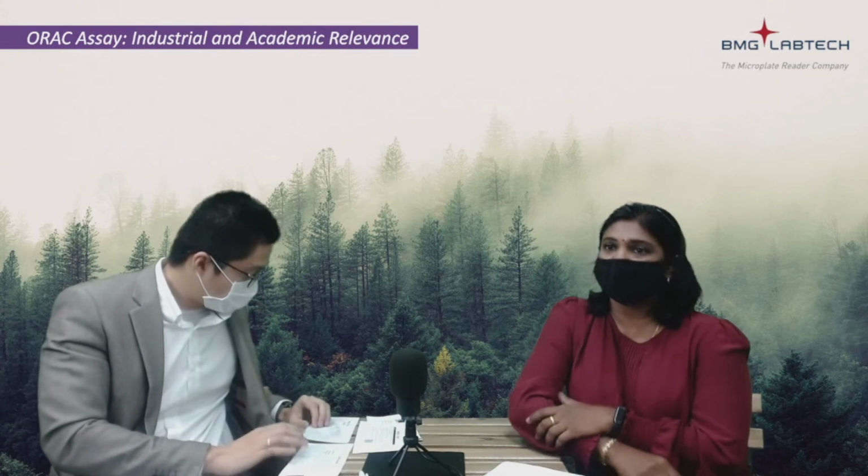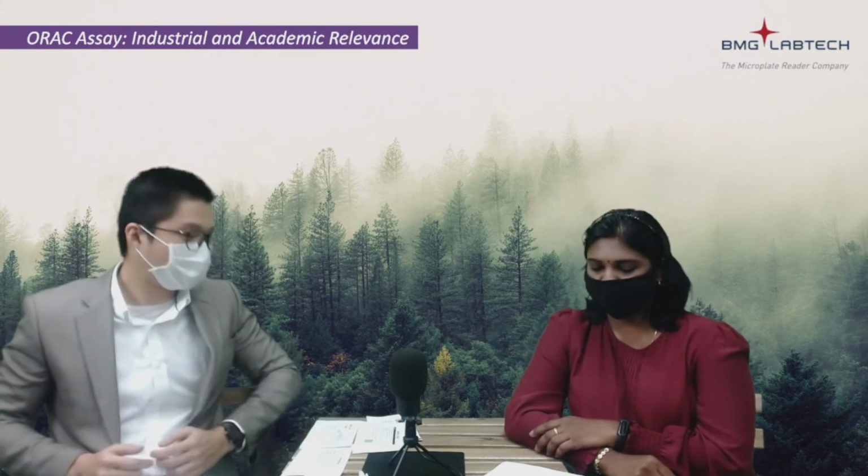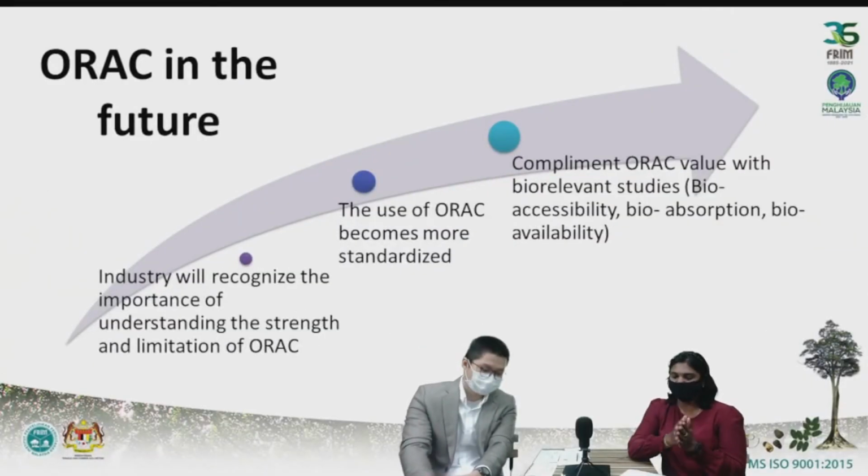So my next question will be on the future of ORAC. How do you see the ORAC assay itself develop into the future? Yes, okay, ORAC in the future. This is my hope. I hope that the industry will recognize the importance of understanding the strength and also the limitation of ORAC, and the use of ORAC maybe can become more standardized in future.